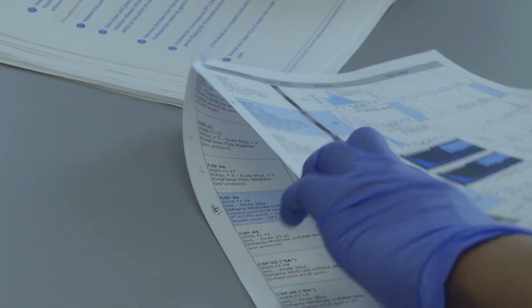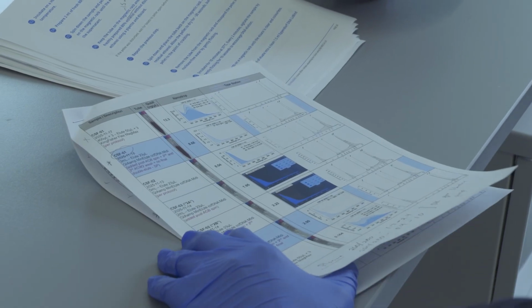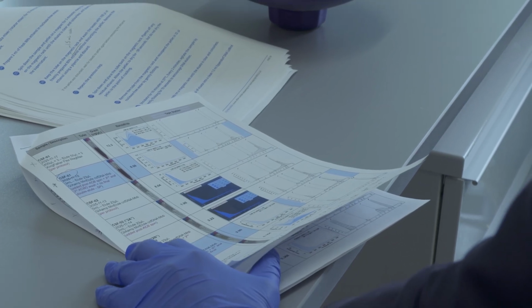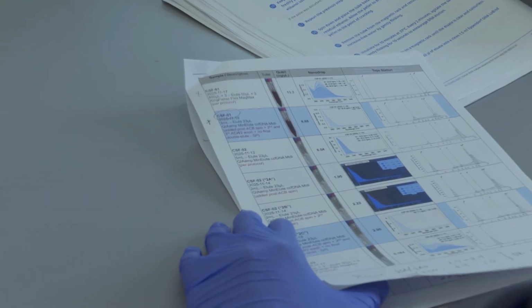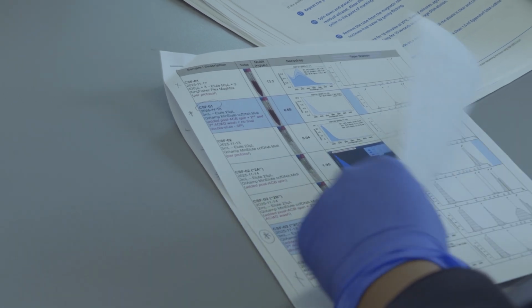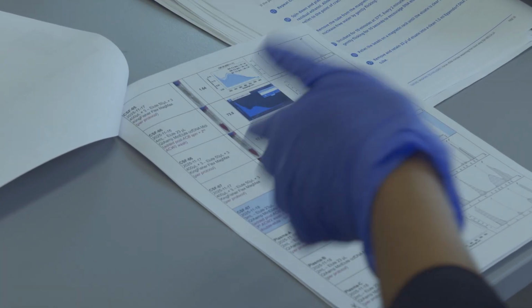So okay, 1, 2, 3. For today, I think we can just do one plasma pool and one CSF pool, and we'll see. You are multiplexing it, right? Yeah, so pool means here we are picking 3 samples and multiplexing them. And for the plasma also, I think we should pick 3 samples and multiplex them. Okay. And then run 2 flow cells.